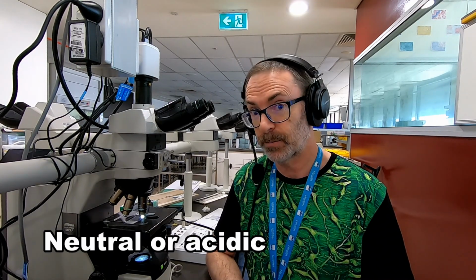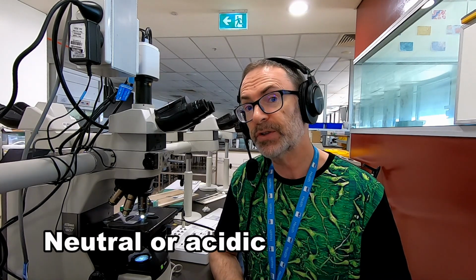This semester, however, in the studies that have been conducted here at QUT for the undergrad students, we delve a lot deeper by exploring the complexity of saccharide chemistry. That is to say that not everything can be considered neutral. So the options are for things to either be neutral or they could be acidic. That is, under physiological conditions, certain types of mucosubstances have a predominance of negative charges. So in terms of histochemistry, things that are negatively charged can be said to be behaving like an acid because they're giving up hydrogen ions.